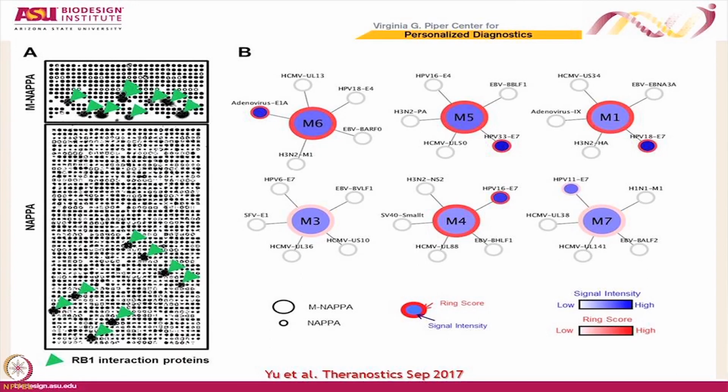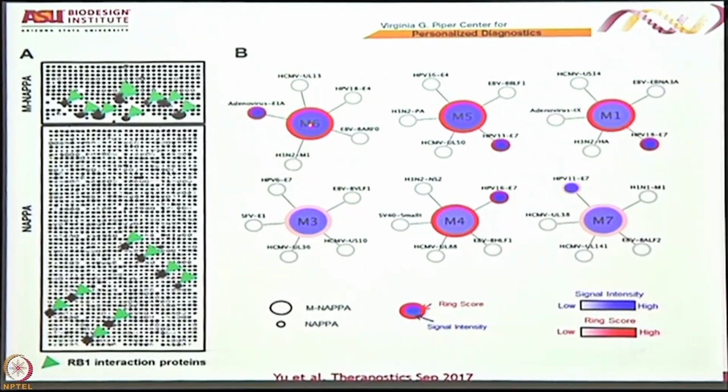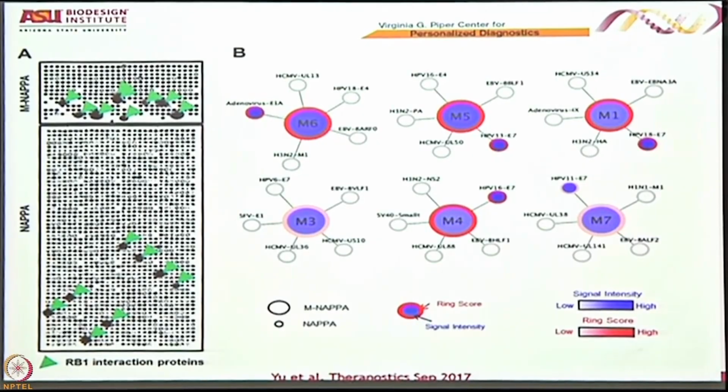So what we ended up deciding to do was this kind of ball and stick model, where this ball is representative of the mixed spot, and each of these individual circles represents the 5 proteins that are expressed in that spot. The color here means that we detected signal at the mixed spot, and color at any one of these spots means that when we tested the individual spot, it also gave color.